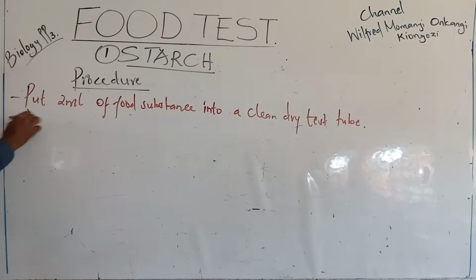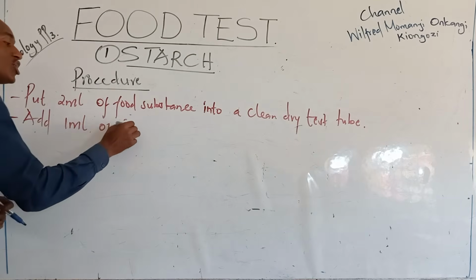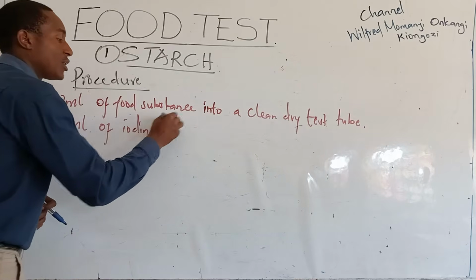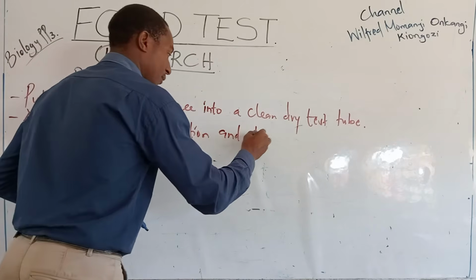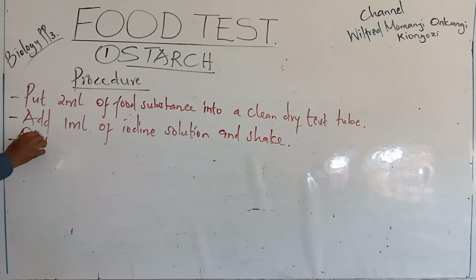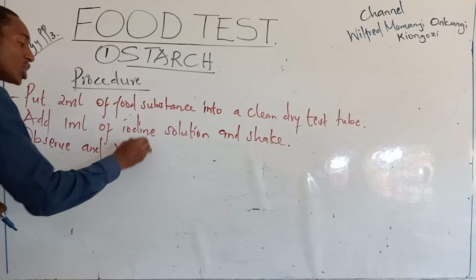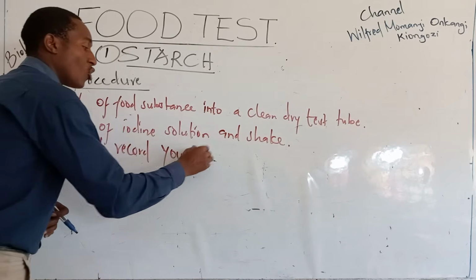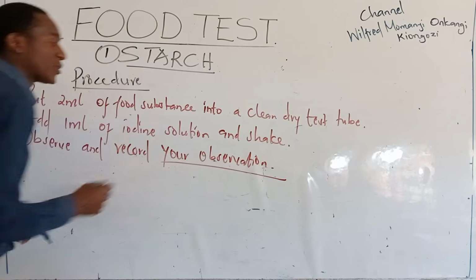Then add 1 ml of iodine solution, and shake. Observe and record your observation. This is a typical procedure.